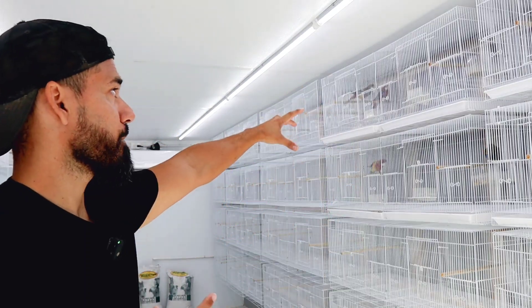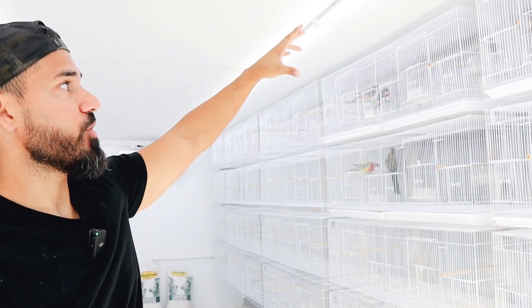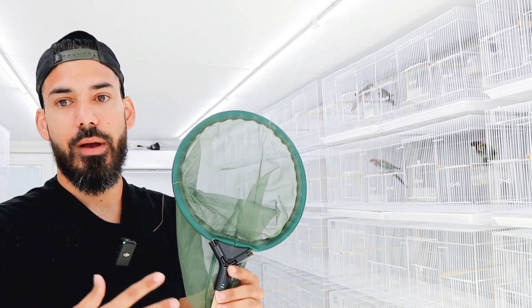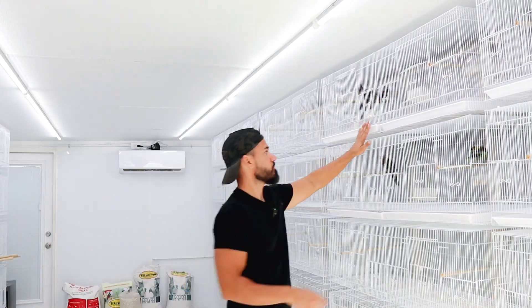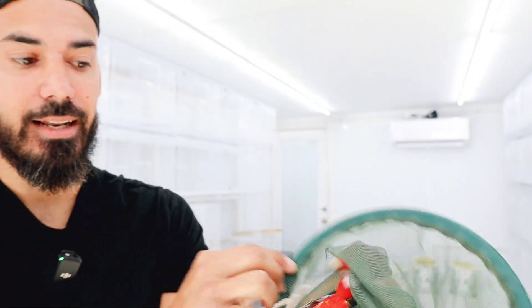We're going to start with the top cage. Unfortunately I have to pull the whole thing down to access the birds because the roof prevents me from opening the door all the way. The way I'm going to catch these birds is with a net — it's the easiest way, less stressful for them, a little quicker. Catch them, clip the nails, and move on. Once I catch the birds, I like to leave them in the net to avoid them using their beak to bite.